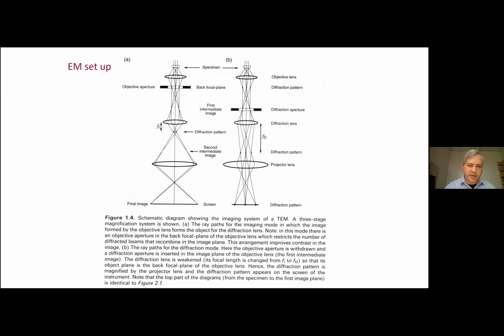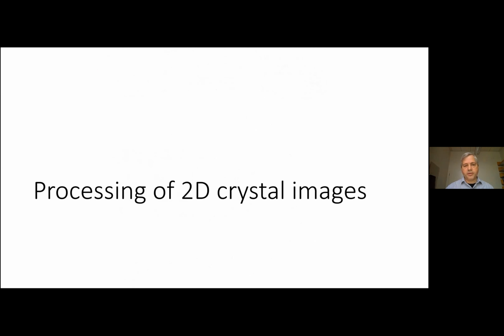And of course the diffraction patterns are easy to collect, because on any microscope, even 20 or 30 years ago, it's the same thing. You basically just change the lenses such that instead of magnifying the image onto a screen, you change the lens strengths and you magnify the diffraction pattern onto a screen or onto your detector. So you just press a button and the microscope reconfigures itself. So that's not hard to do. But you did tend to collect both types.